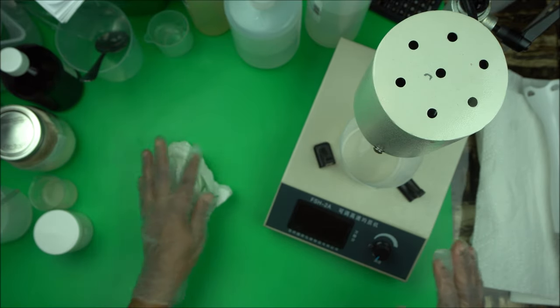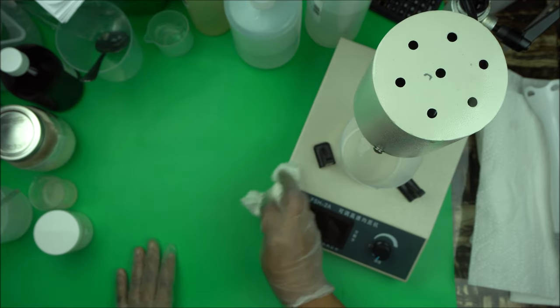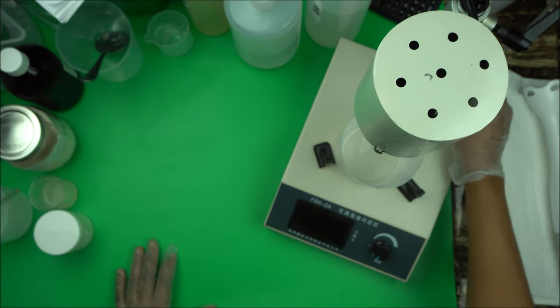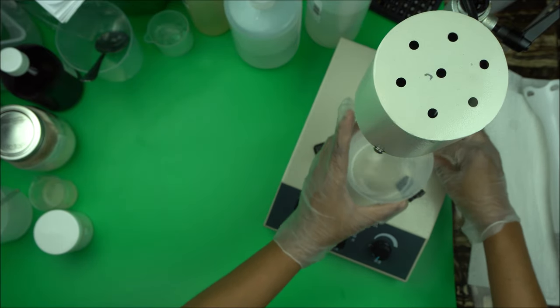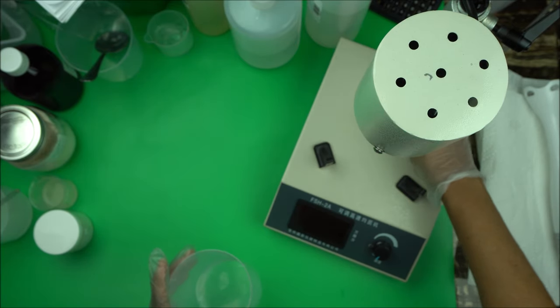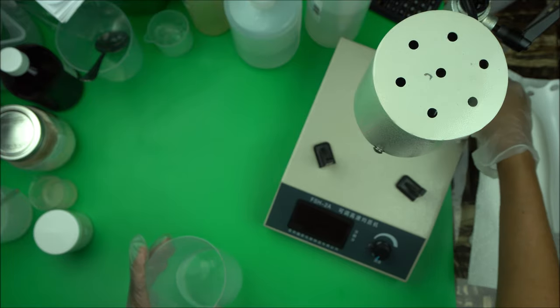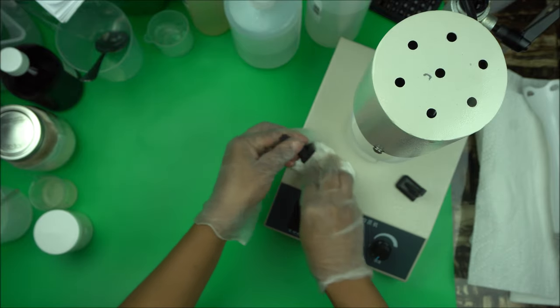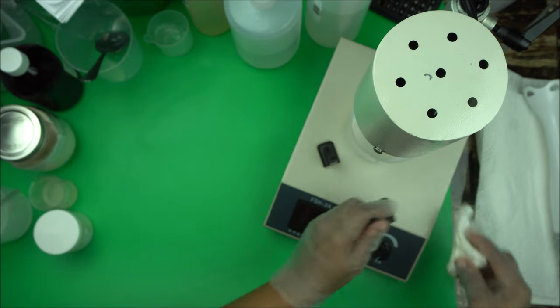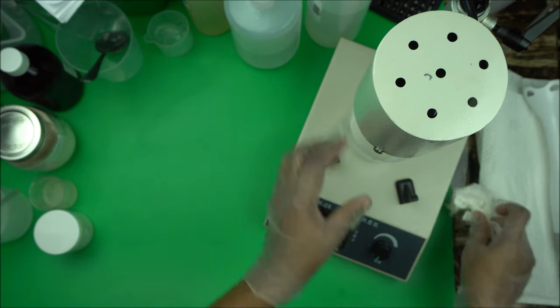Right now I'm currently using this homogenizer at home. This is not what I use at work, but when I have to do sample formulation at home, this is the homogenizer I use and this is what a lot of indie brands start with. So if you need to take your formulation level to another professional level, you need to find yourself a homogenizer.